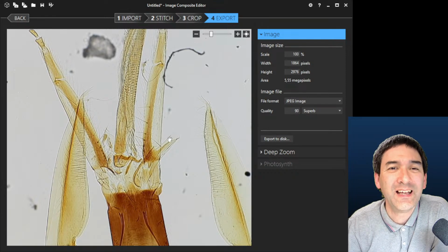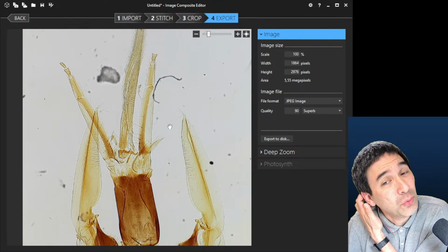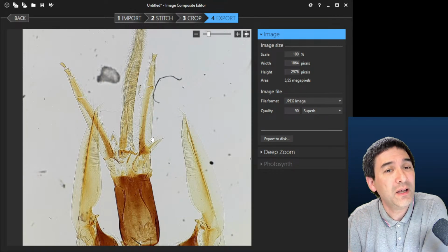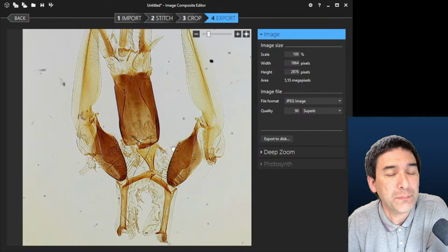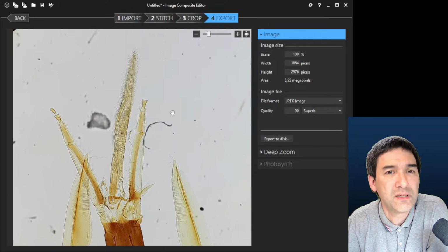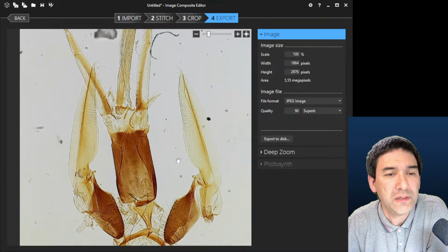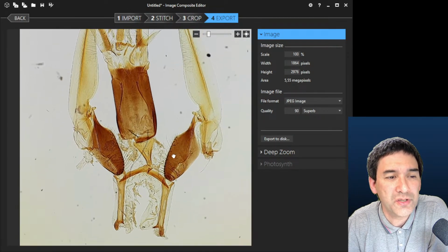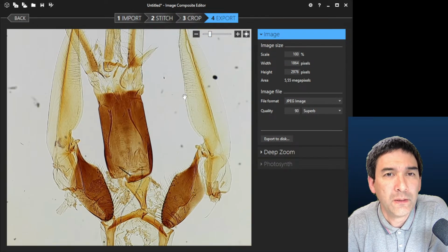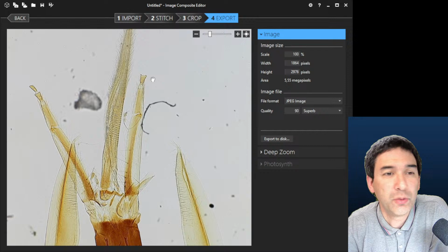Okay. I think it's a little bit of a pity that the program is not updated anymore, and I'm not aware of any other free program that is able to do that. I know that there are some commercial panorama software available, but this one actually works really nice.